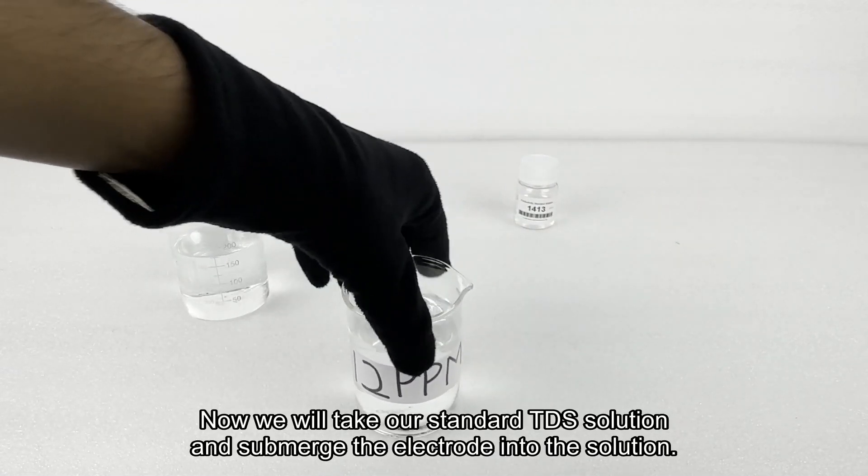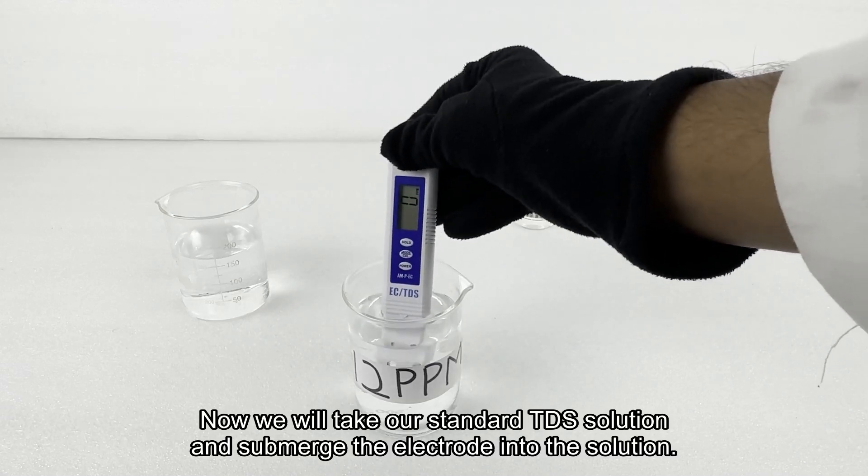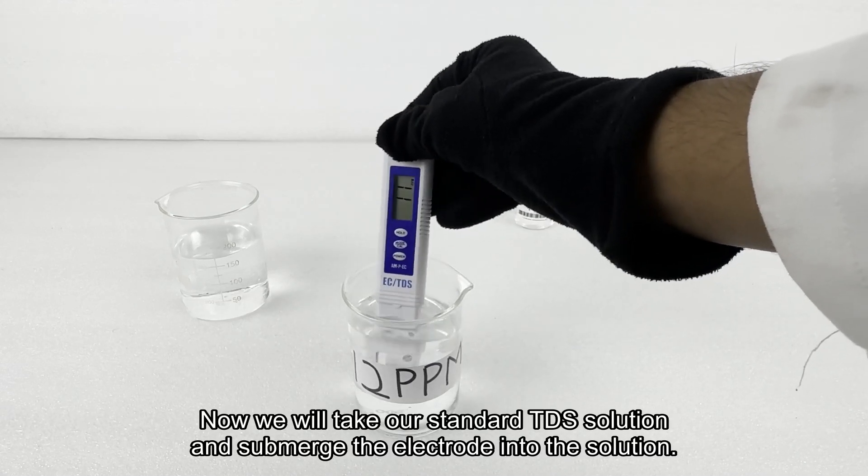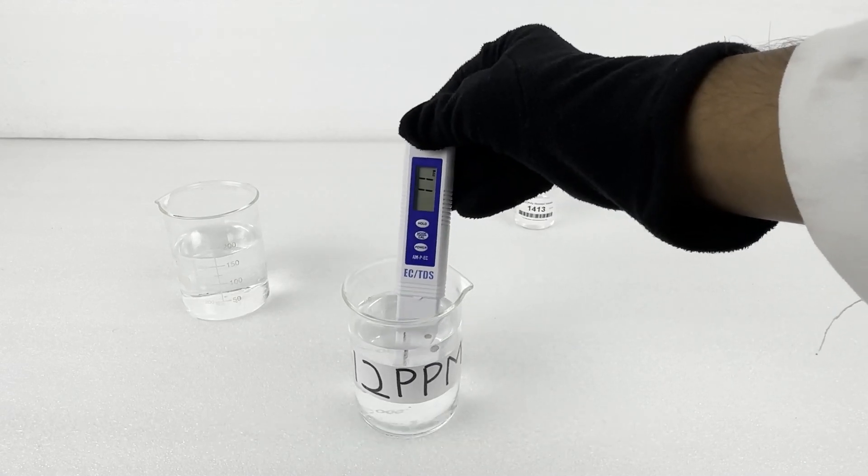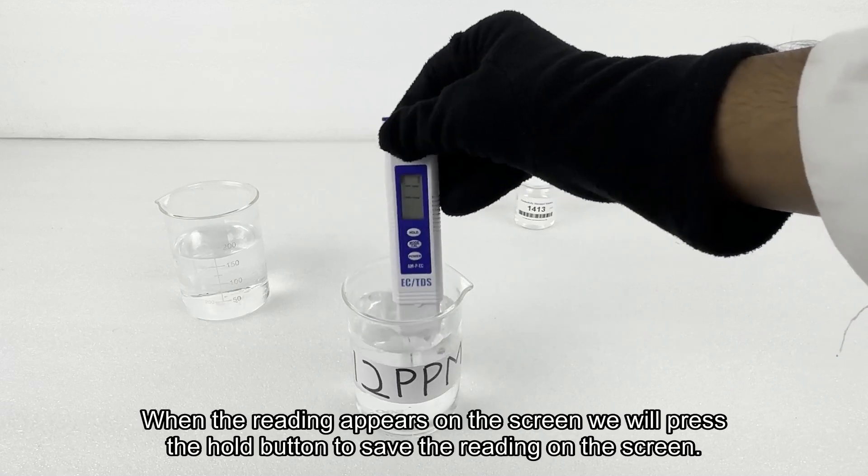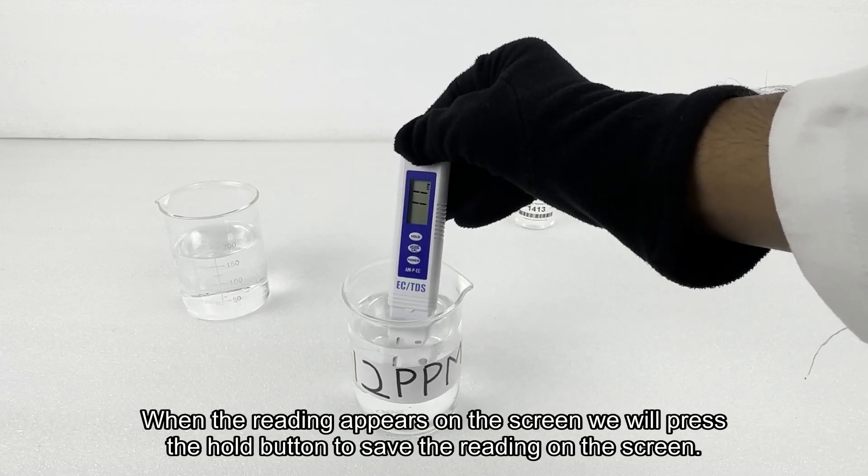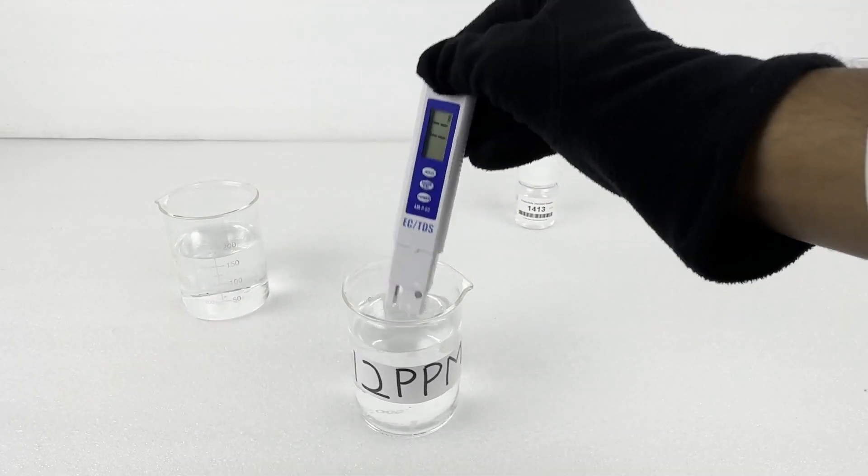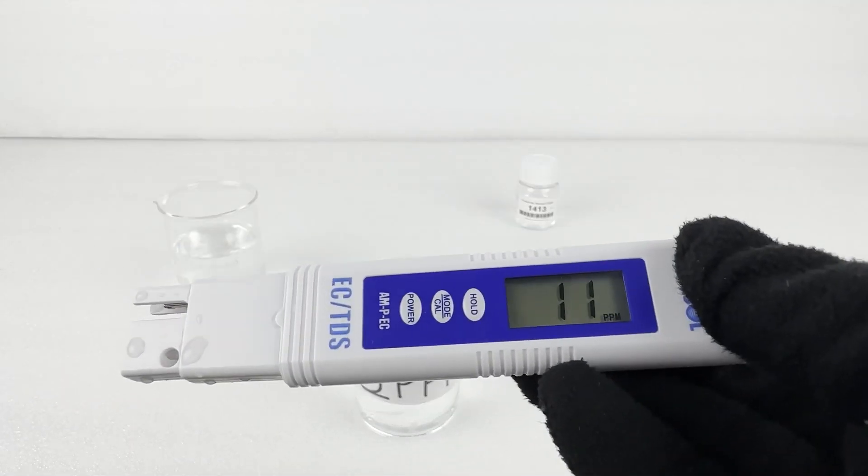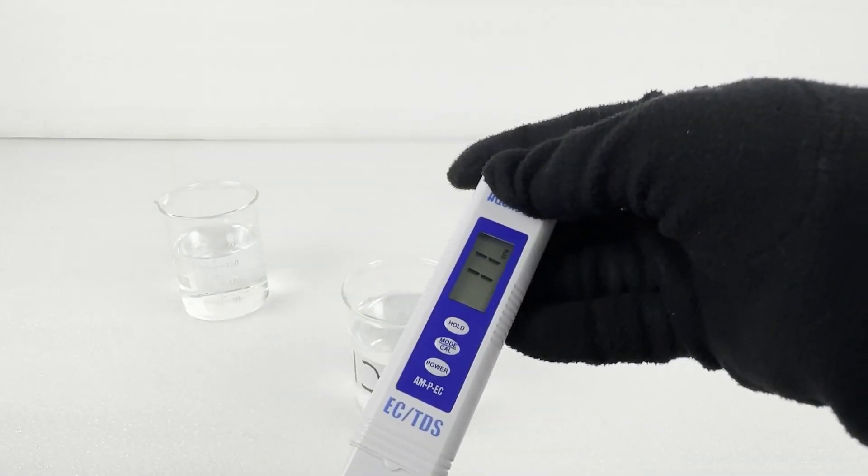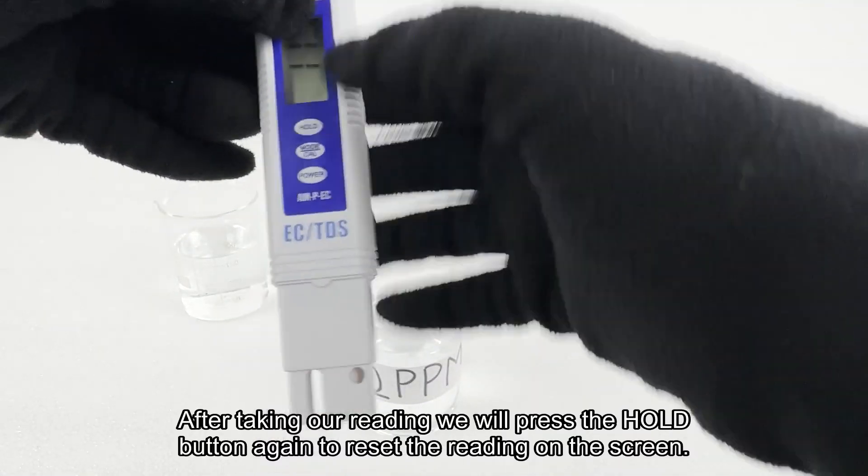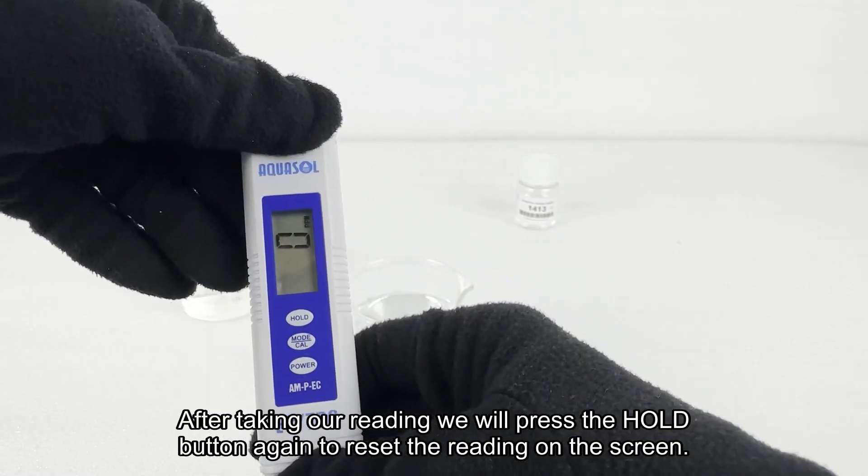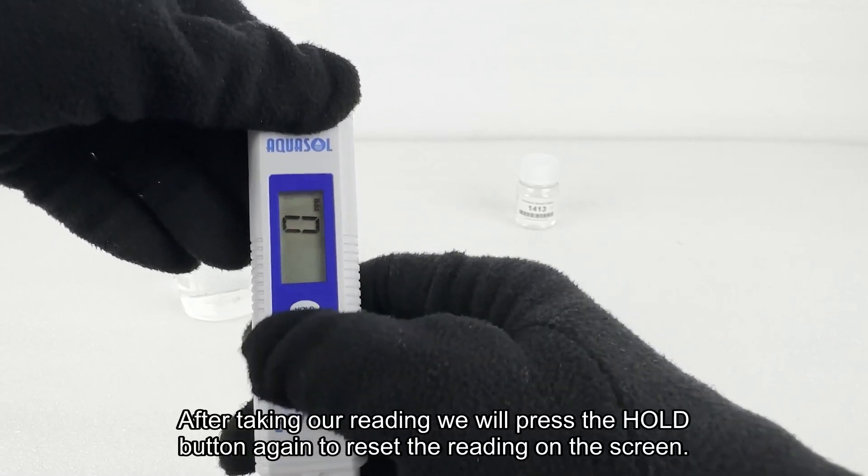Now we will take our 12 ppm standard solution and submerge the electrode into the solution. When the reading appears on the screen we will press the hold button. After taking our reading we will press the hold button again to reset the reading on the screen.